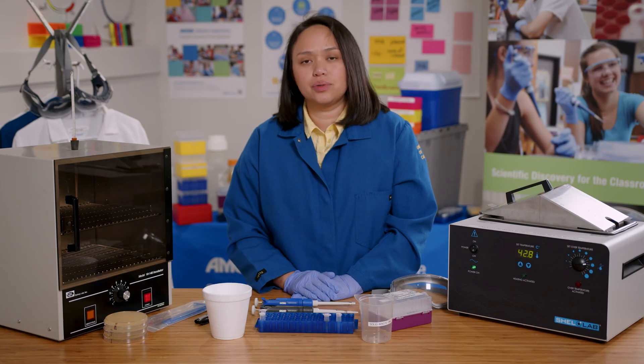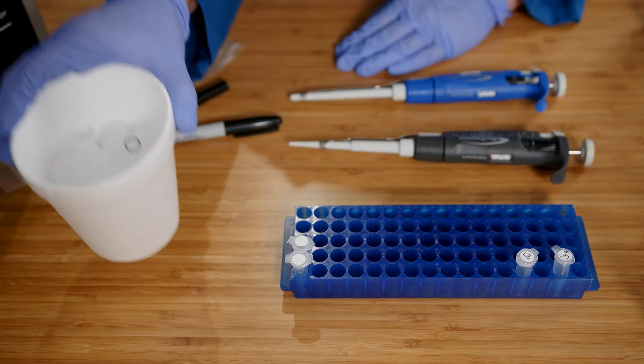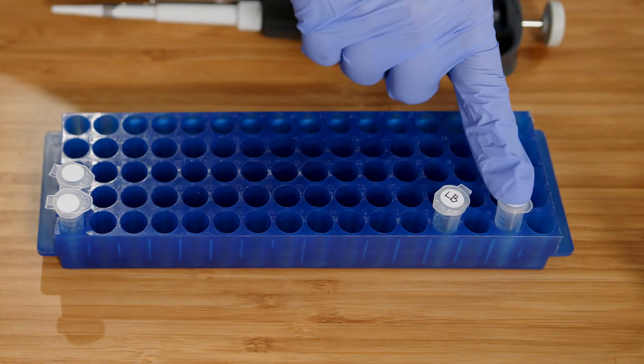I will also do a control setup. The control setup will have the competent cells, but I will not add the plasmid.